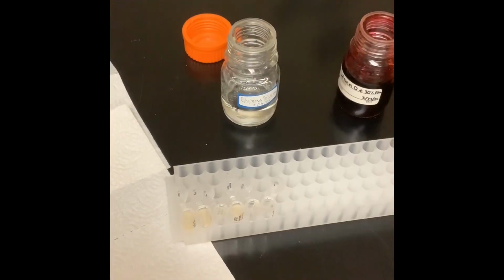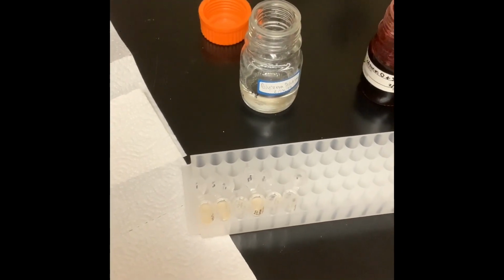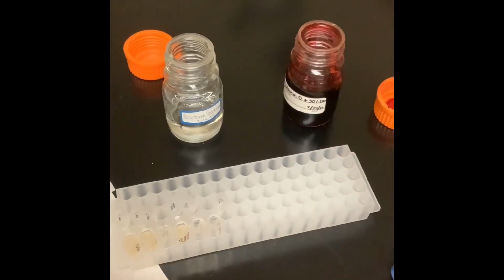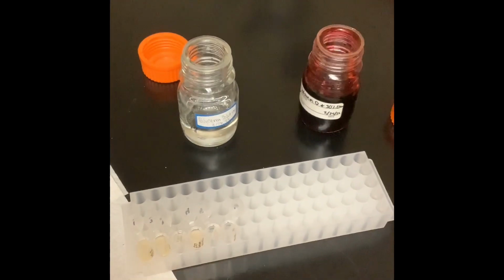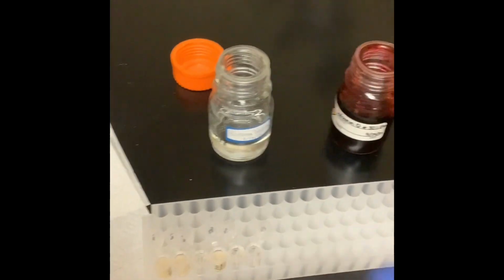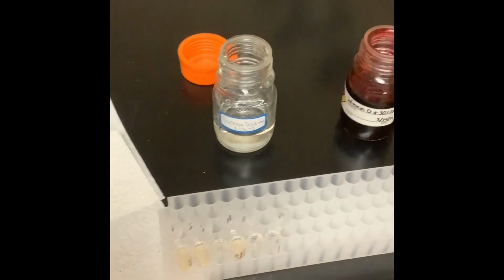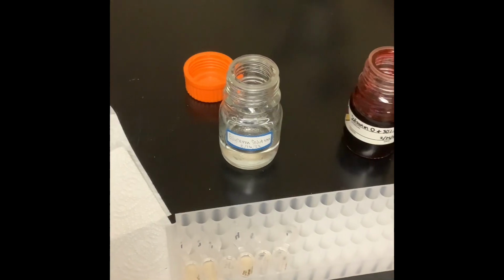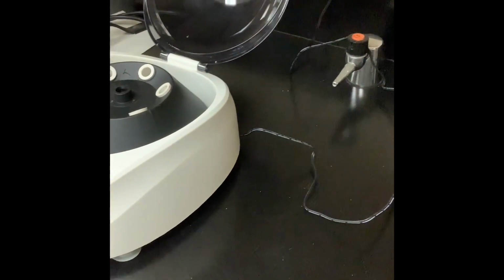After the water has been removed from your samples, it's now okay to work outside of the hood. The next thing you're going to do is add 1 drop of this Safranin O stain to each tube, and then you're also going to add 1 drop of the glycerin solution to each tube. Then you're going to shut the tubes, mix them gently, and then centrifuge one last time. I only do a minute for this last centrifuge.